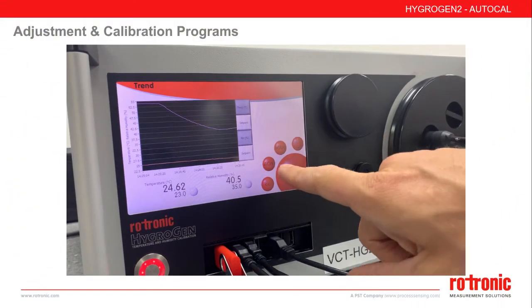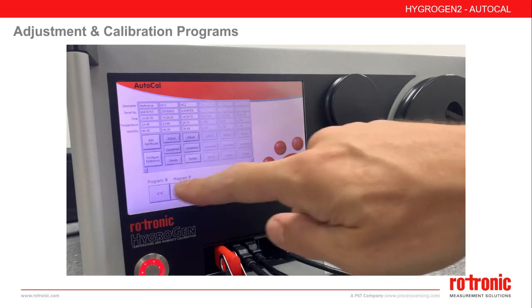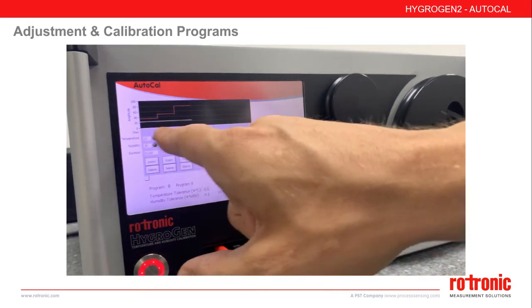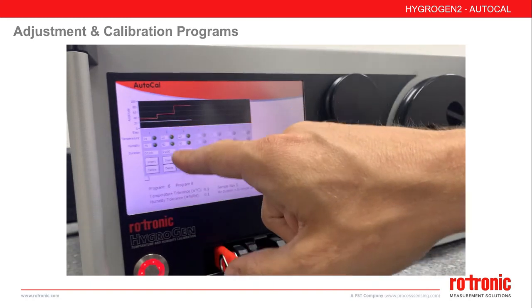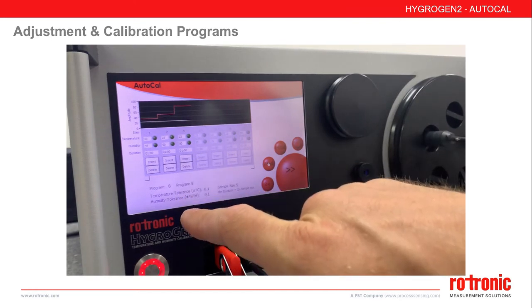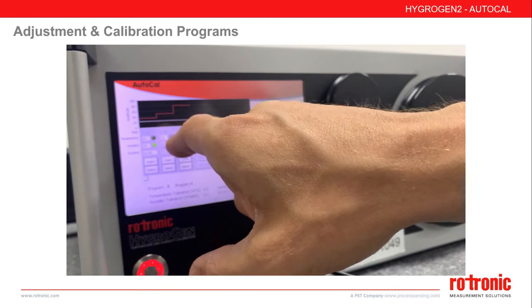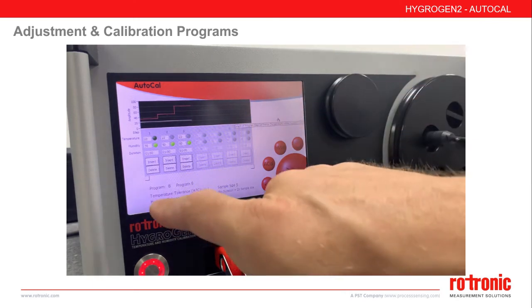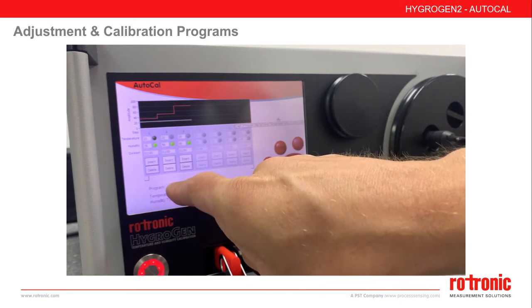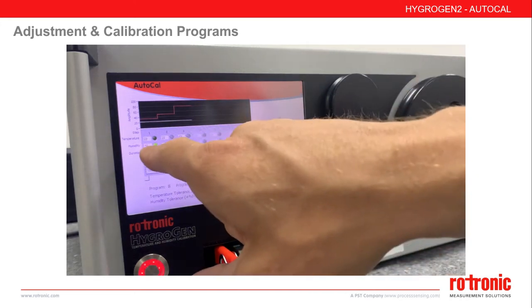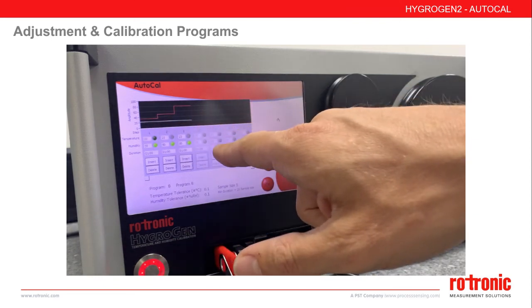Let's take a closer look at the programmer page. First, select your desired program to edit. Here we can see a very typical three-point calibration run, all at one temperature: 23°C at 35%, 23°C at 50%, and 23°C at 80% — a very typical run. This is calibration only. If we wish to adjust, we have to specifically select the radio buttons on the points we wish to acquire data and apply adjustments. By selecting these three points, AutoCal will acquire humidity conditions at each step and apply the adjustment to the probe at the end. In this case, this would be a three-point humidity adjustment with no temperature adjustment.